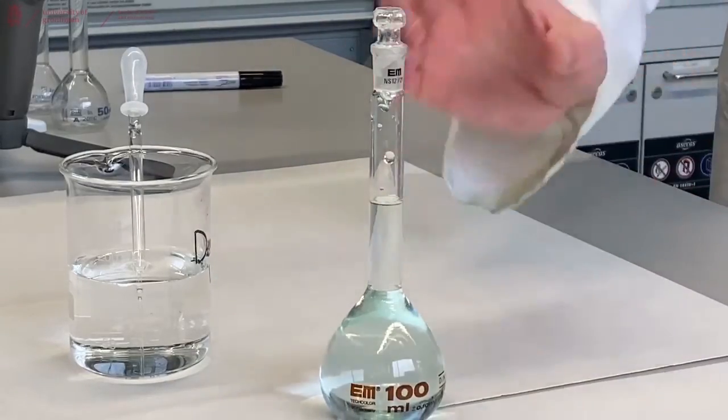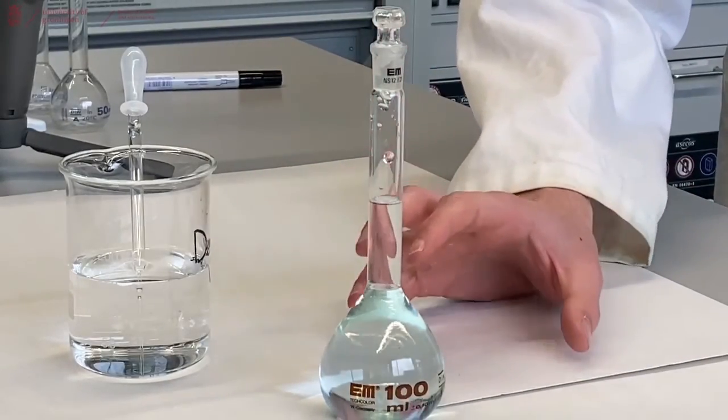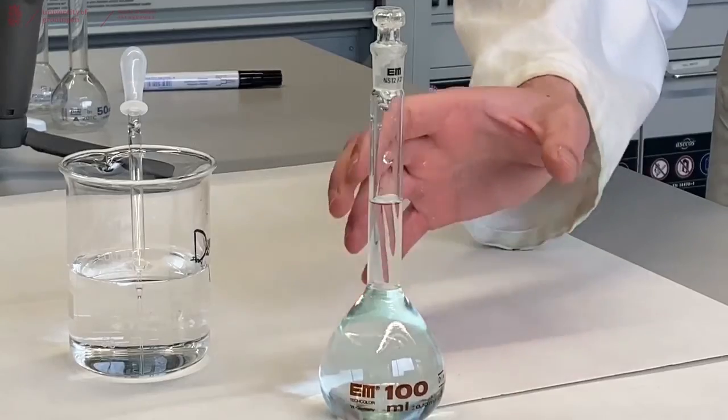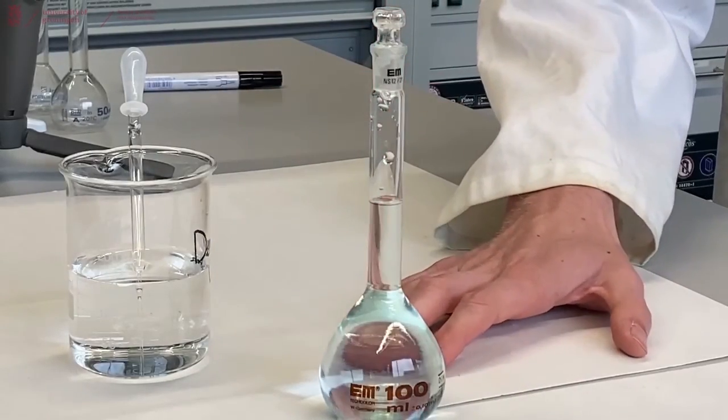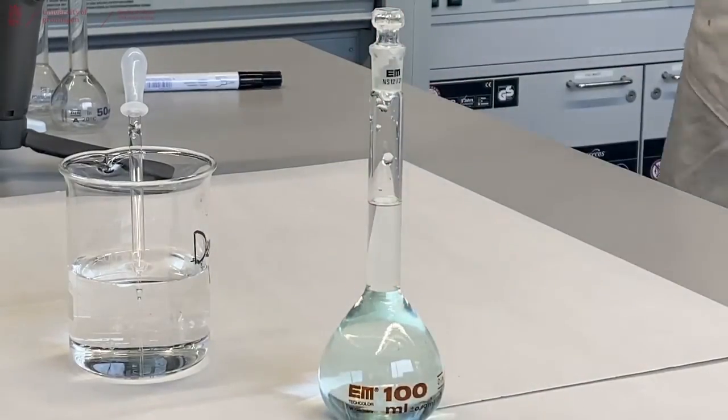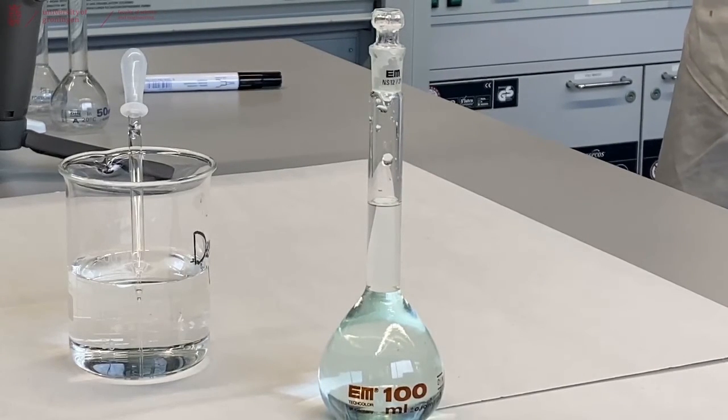So we know that the total liquid in this flask is now the correct concentration that we wanted to have, or of the known concentration that we can now calculate. And that's how you use a volumetric flask.